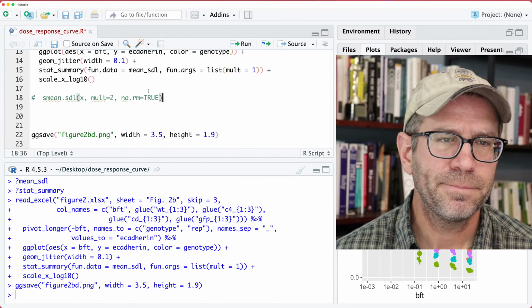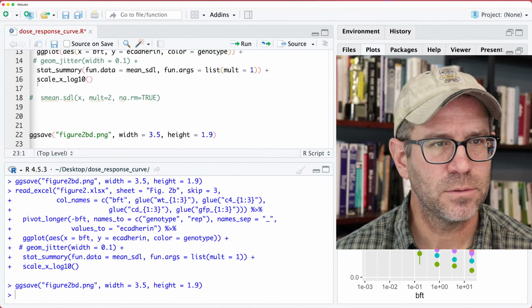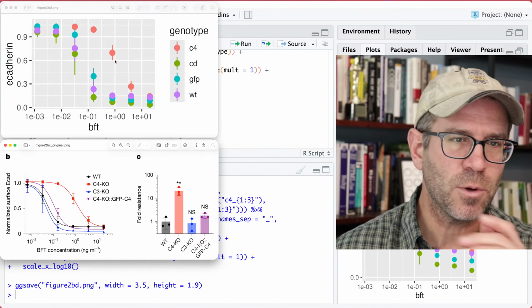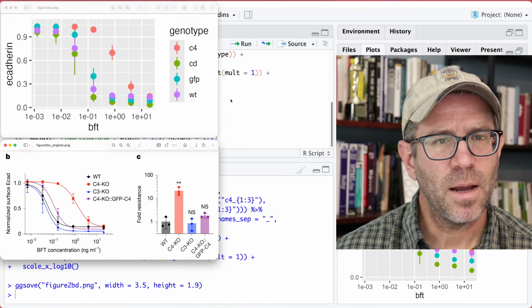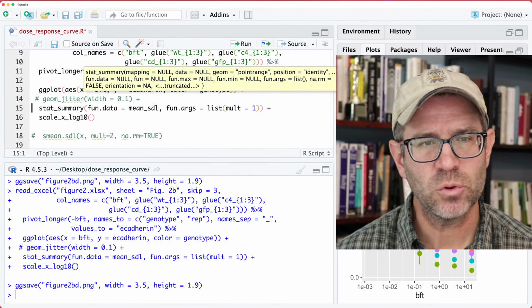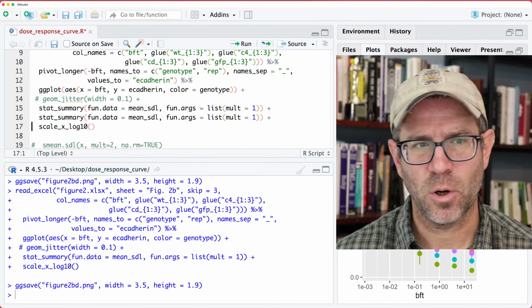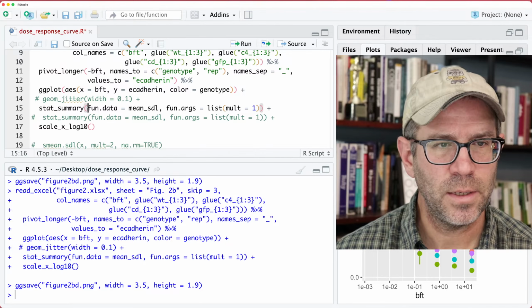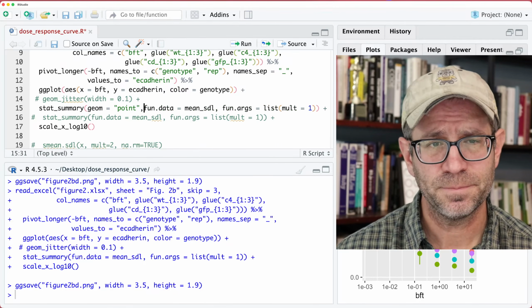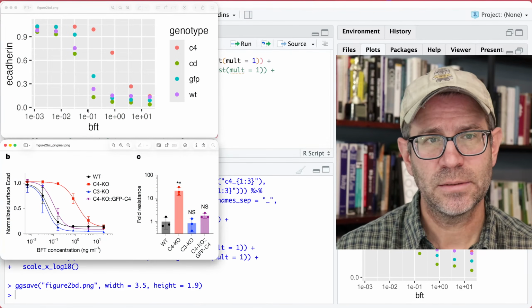So for the time being, I'm going to comment out the geom_jitter so it's easier to see, right? And so those smaller points went away. Again, I'm going to have to run stat_summary twice, once for the mean and once for the error bar. So in here, remember one of the first arguments was geom. I can do geom point, right, like this. And so now you see I get those points.